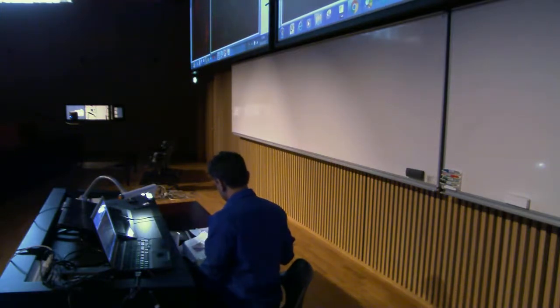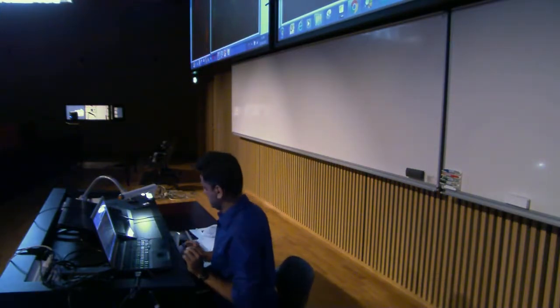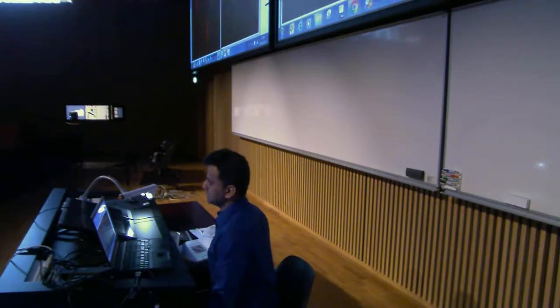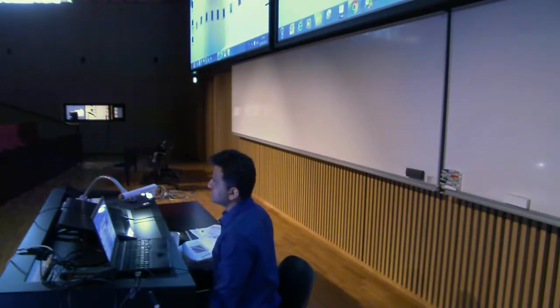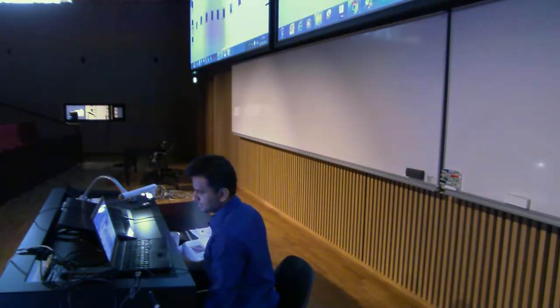We still have 15 minutes actually. So let me check. Oh, we haven't covered this machine learning based image segmentation. So quickly, if we have time, we can just do this. Sometimes it is not possible to do an accurate segmentation, so we have to train our computer on what I'm interested in. I will just show you how.